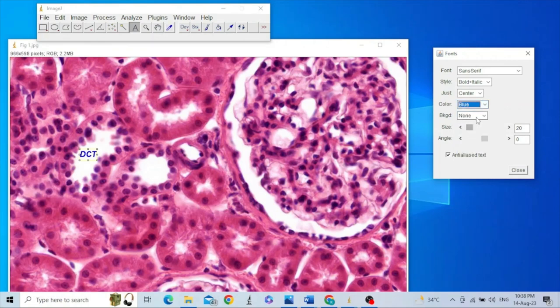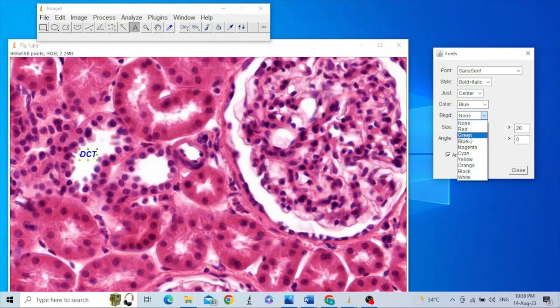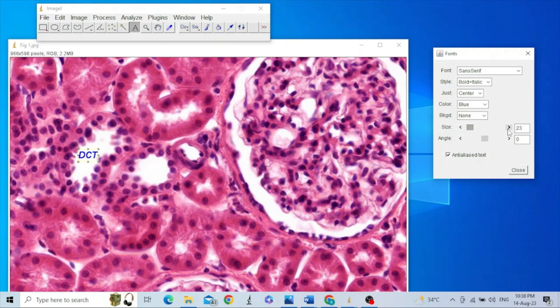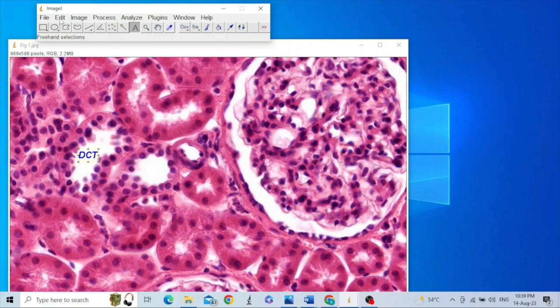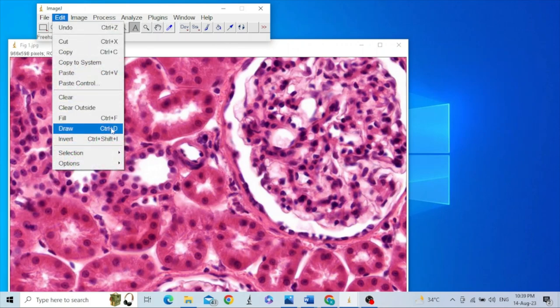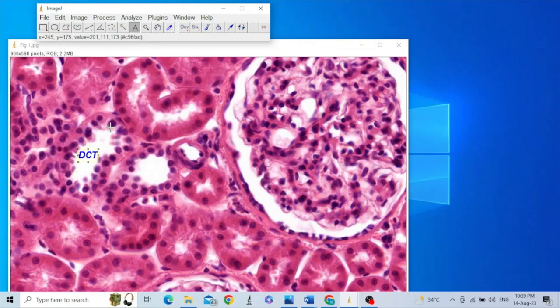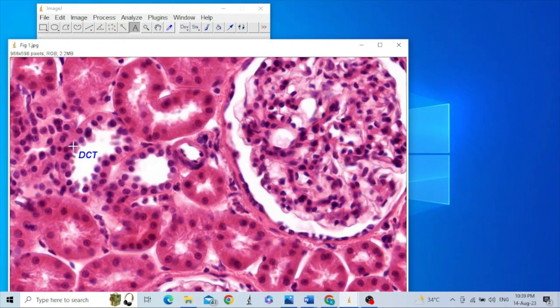We can change the color — for example, to blue. You may add a background if necessary. The font size can be increased or decreased. We can also write the text at some angle. After setting your options, click Close, then go to Edit and click Draw.